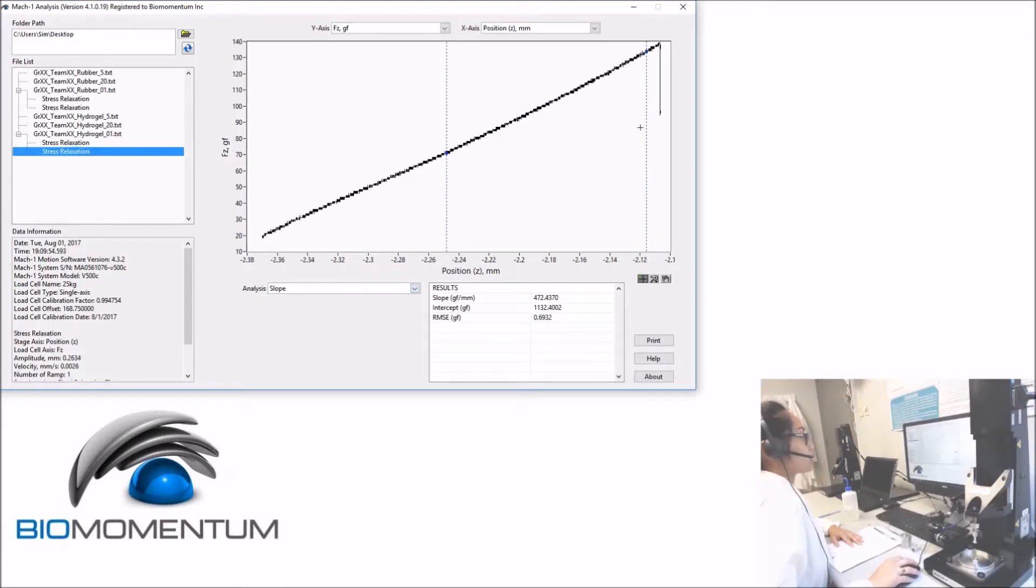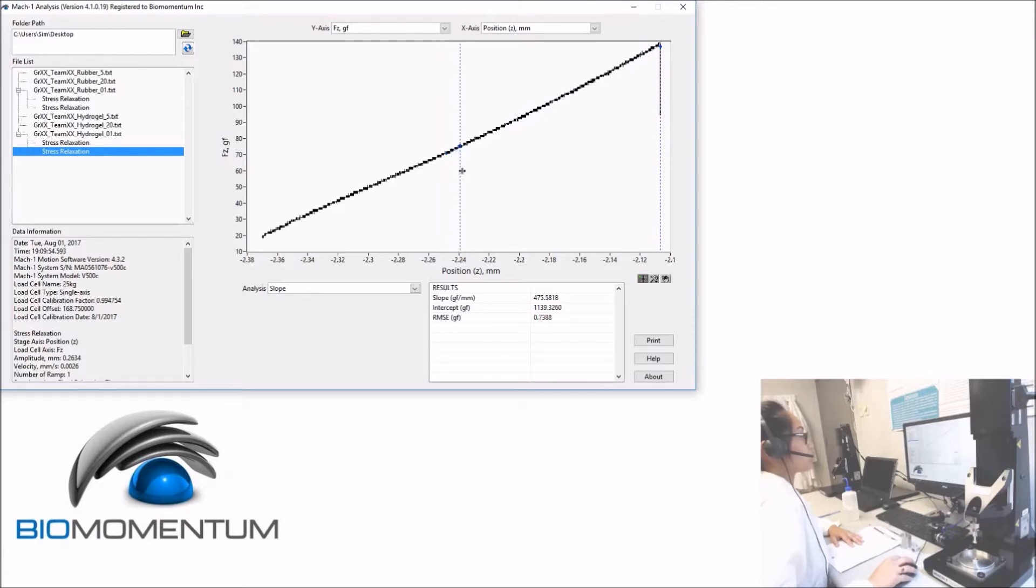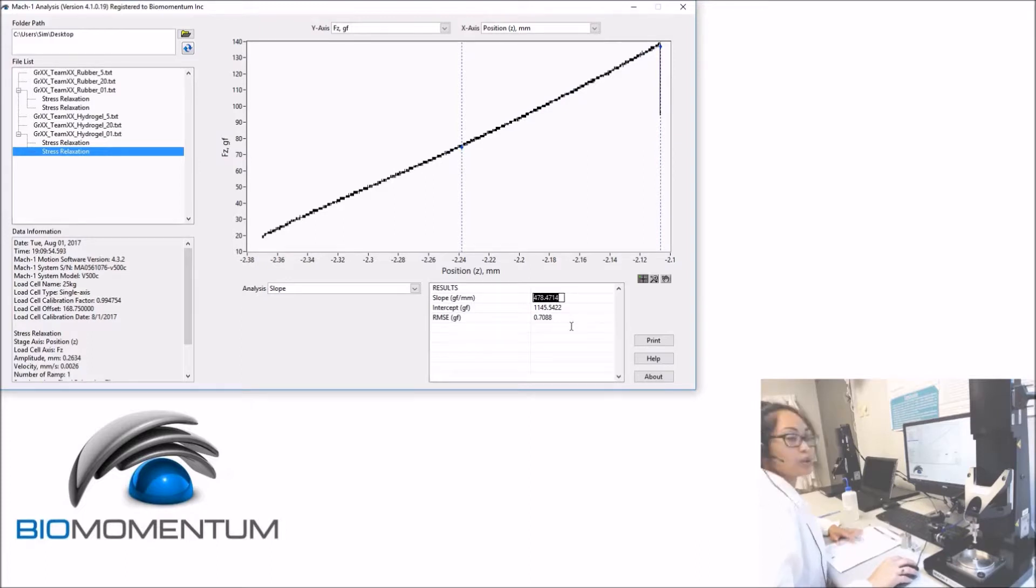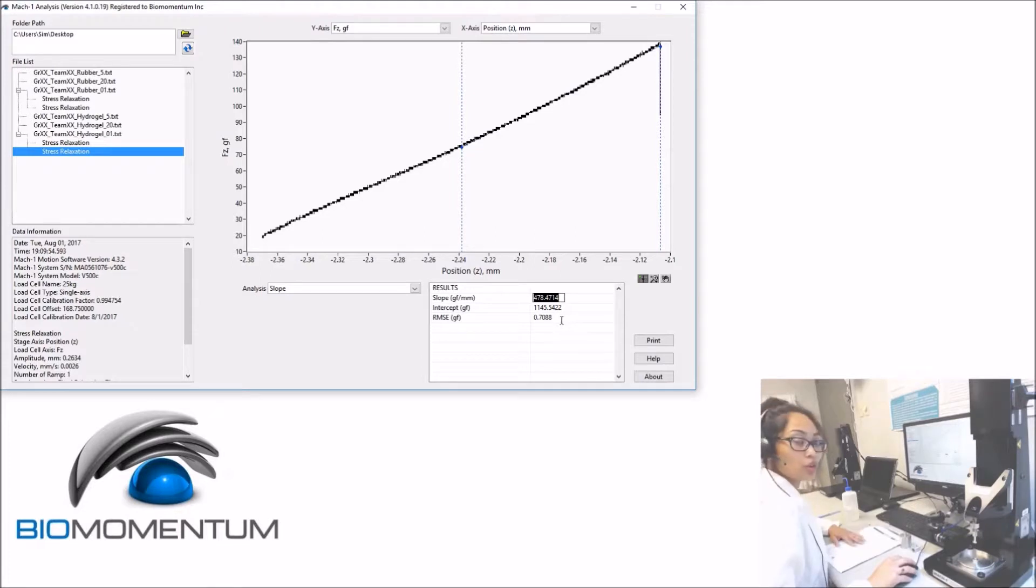Position the cursors accurately to correspond to the last 50% of the slope. The calculated slope corresponds to the stiffness of the hydrogel disk, which in this case is 478 gram force per mm.